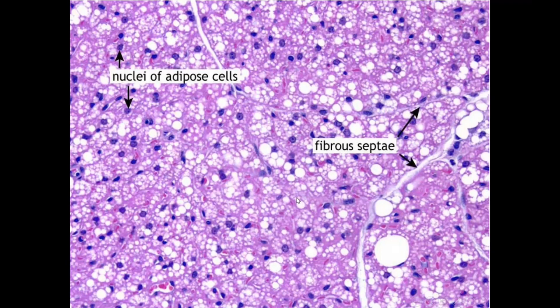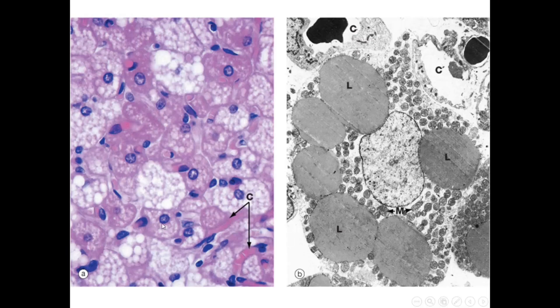You can see a section from the brown adipose tissue with multiple lipid droplets inside the cells and the nucleus in the central position. At higher magnification you can see the centrally positioned nucleus and multiple droplets. Electron microscope pictures show the nucleus, fat droplets, and a large number of mitochondria inside the cell.